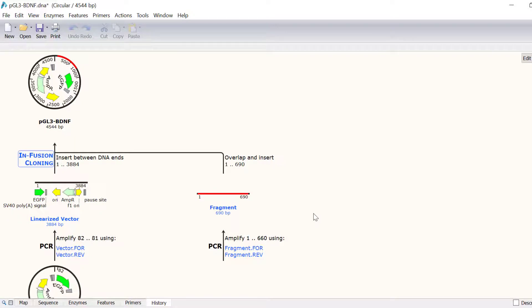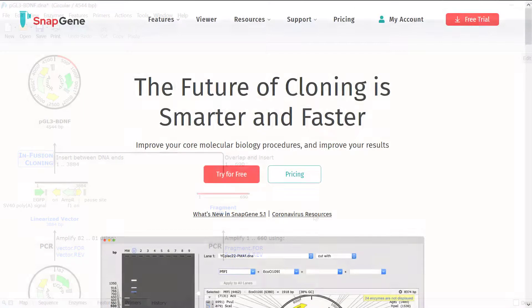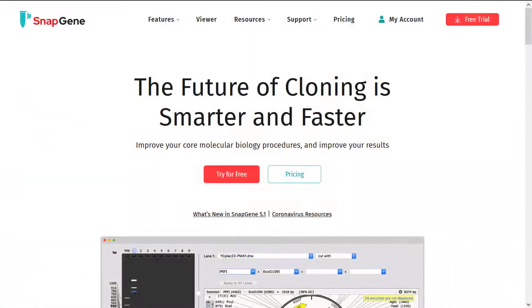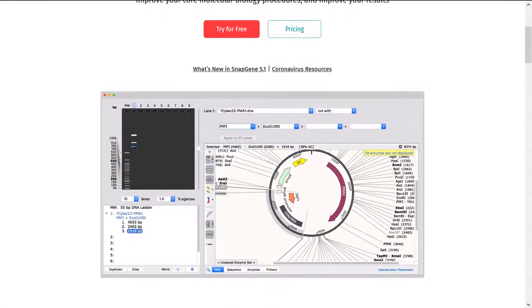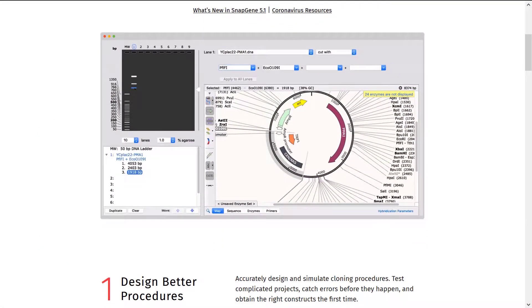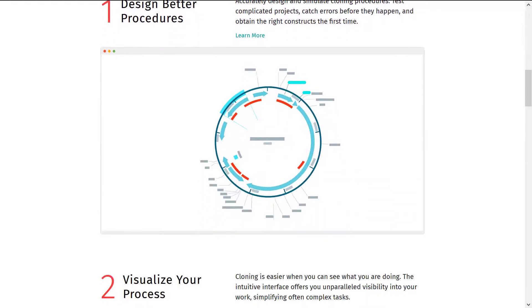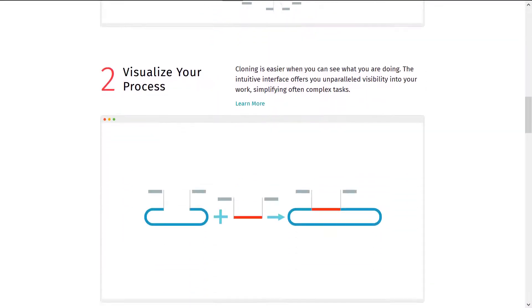In this video, you have learnt how to simulate infusion cloning in Snapgene. For more information about simulating other cloning techniques in Snapgene, check out the other tutorials on the Snapgene website.